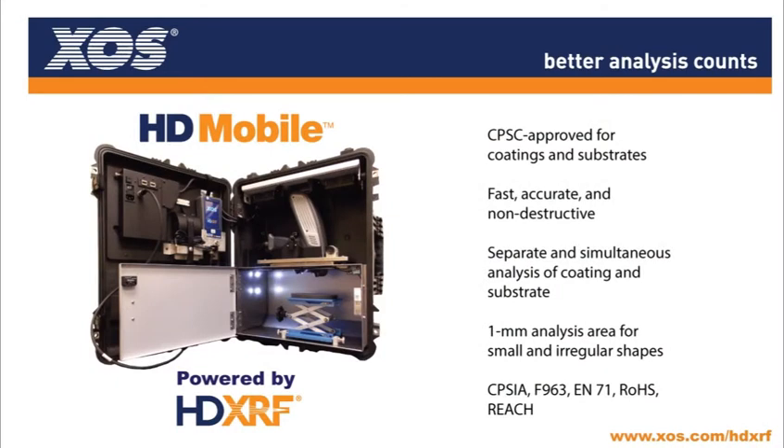The HD Mobile Analyzer is fast, accurate, and non-destructive, and its smart case design ensures compliance anywhere along the supply chain.